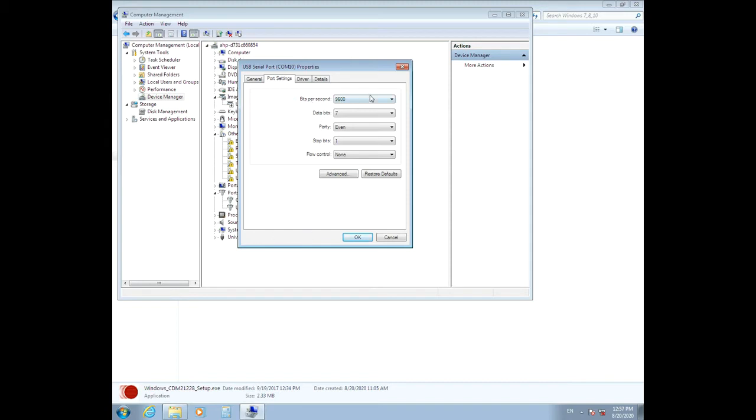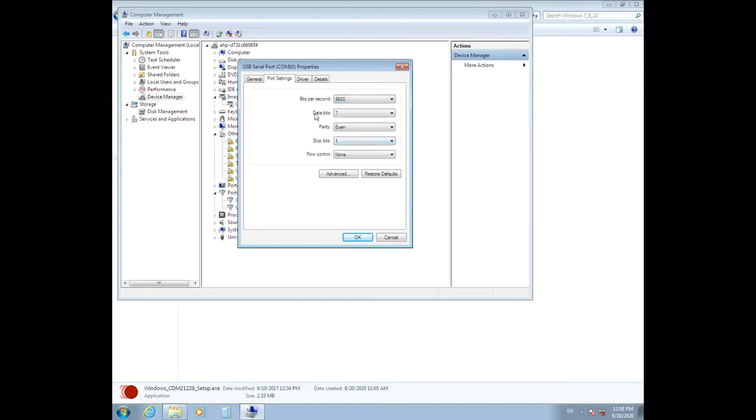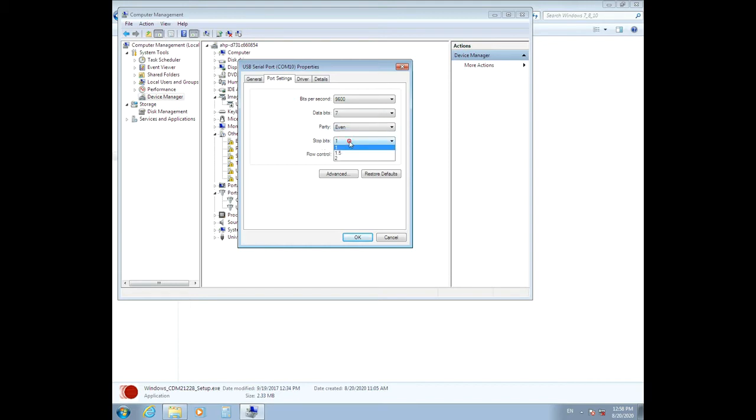Bits per second: 9600, Data bits: 7, Parity: Even, Stop bits: 1, and Flow control: None.